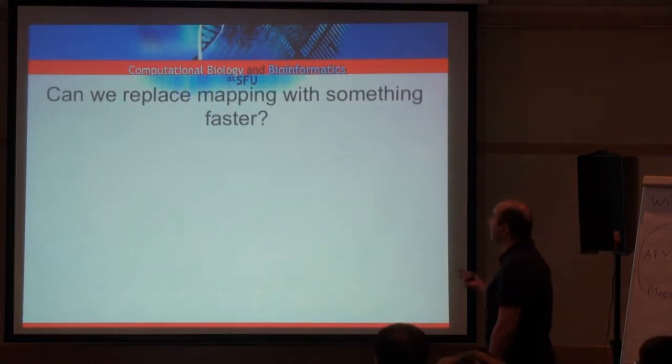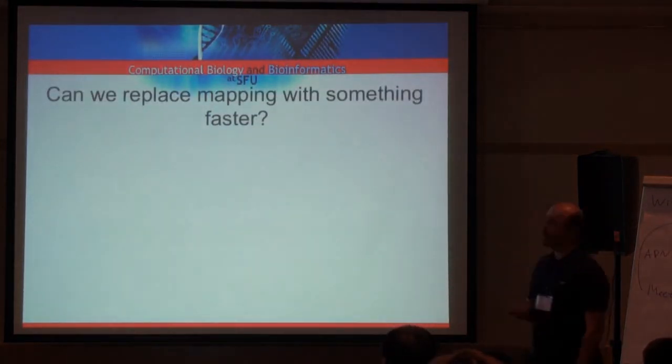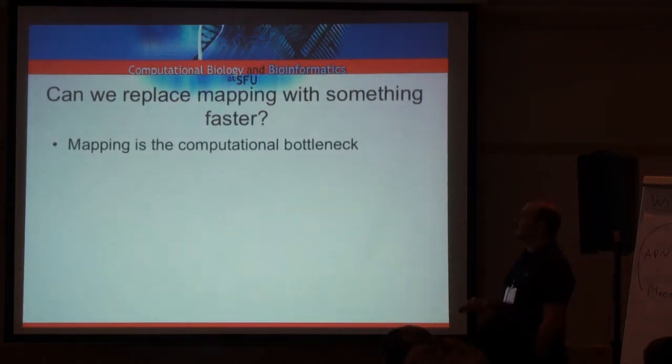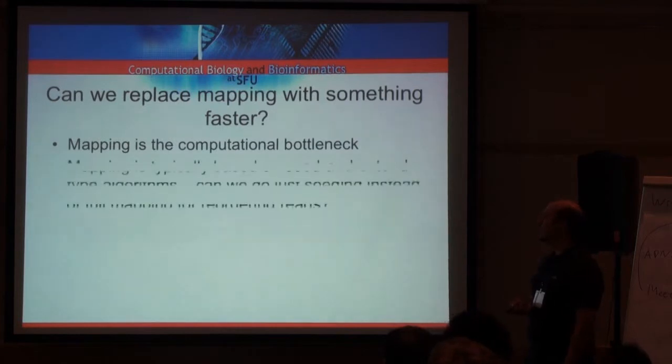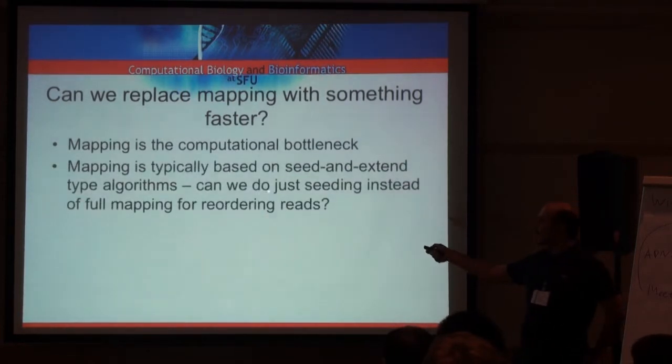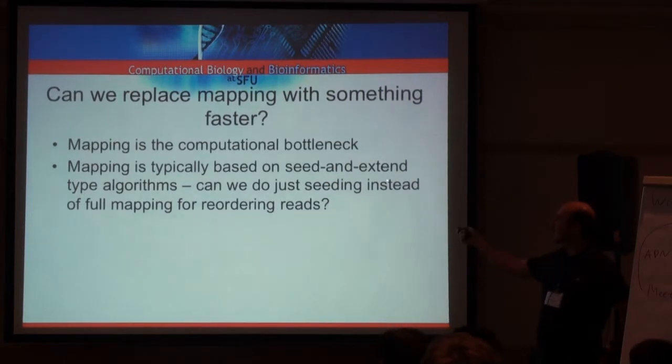So can we do something to replace mapping, provided that it's the computational bottleneck? If you remember, mapping is typically based on seed and extend type algorithms. So we do the first stage of mapping, but not the second stage.